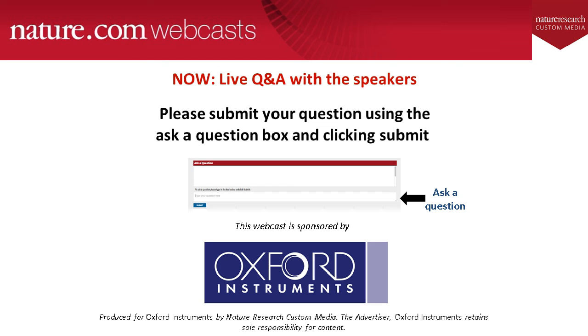Excellent. Thanks, Louise. Our next question says, many modern SEMs routinely use partial pressure in the sample chamber to permit examination of non-conducting materials. How will a windowless detector function in such instruments?